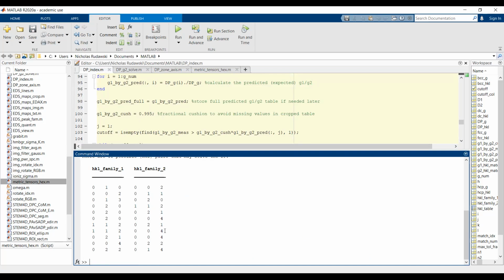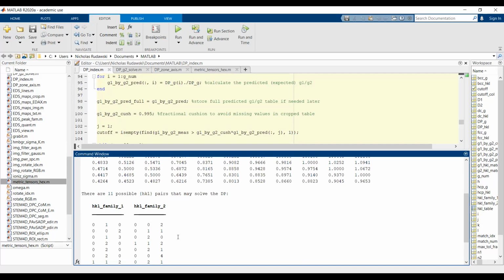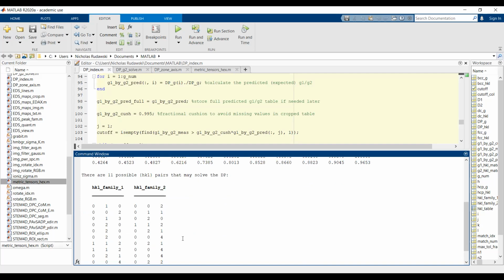Again, one of the constraints is that we have to have the spots arrangement work out, right? And if we don't, that would be an indication that the solution probably is not valid.